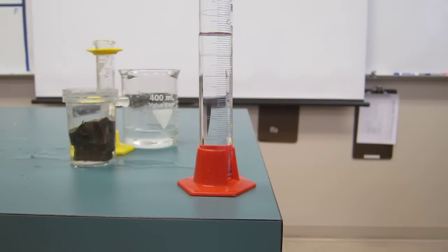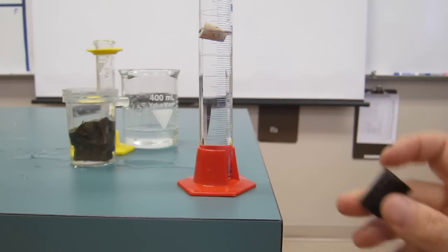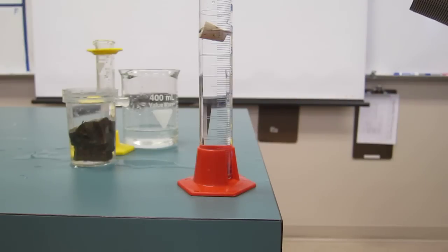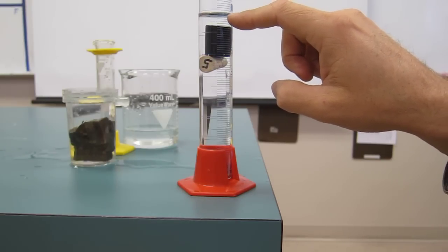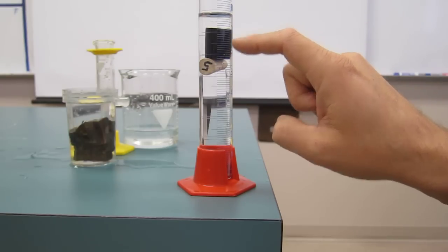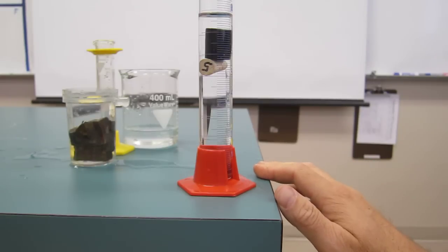And the problem with the cork is it floats. So you can't really figure out its volume. You got to get it underneath the water. So what students did, they problem solved. They remembered that this had a volume of 6 milliliters and it sunk to the bottom. So students that were really thinking figured out they could do this. And now the volume went from 70 up to 78 milliliters. So it went from 70 to 78. Remember, this had a volume of 6, so you should now be able to figure out the volume of the cork. So that was another thing that students problem solved.